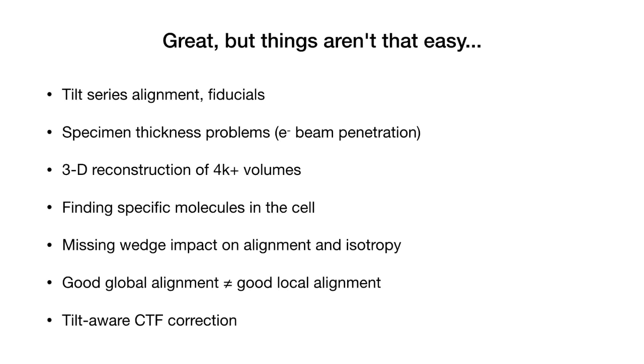Things aren't quite as easy as I just sort of made that seem. There's a whole bunch of steps that are involved in actually achieving these 3D reconstructions. And historically, doing this process involved piecing together multiple sets of software. So David Mastronarde's IMOD package was terrific at sort of doing the original reconstructions of the particles. You could pick out fiducial markers, and you could align the fiducial markers, and you could get a three-dimensional reconstruction. But then if you wanted to go in and pull out the individual particles and then do subtomogram averaging on them and try to push to high resolution, you had to move to other software packages for that.